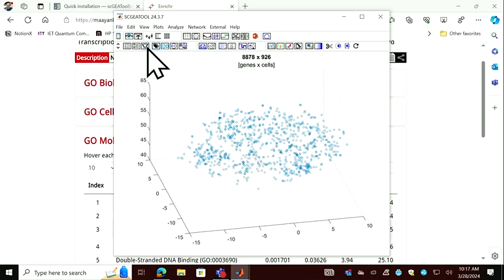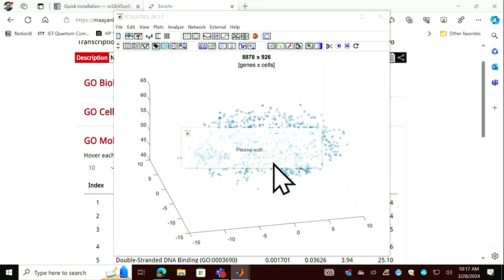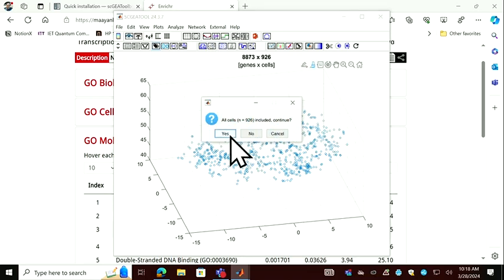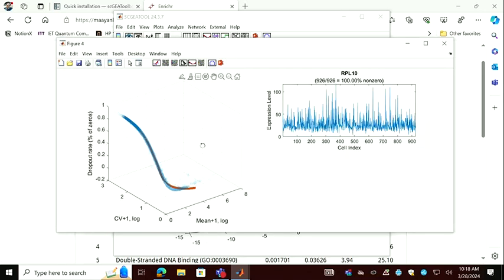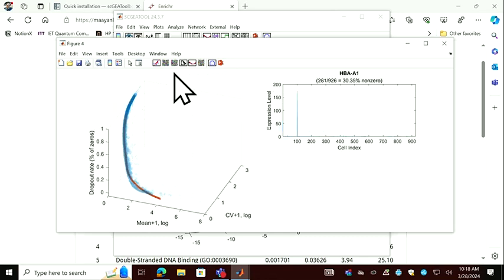But if you run highly variable gene analysis with this population, I hope the hemoglobin gene will not be included in the results. Yeah, so they should be gone. Yeah, it's still here. There's one still here. This is contributed by just one cell, right?